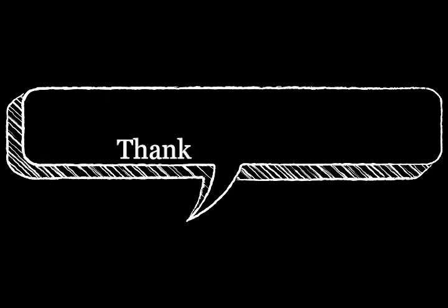So it means that now you know how to look around for the data on ArrayExpress and how you can download the relevant information, and how you can process that information is also available on my YouTube channel.